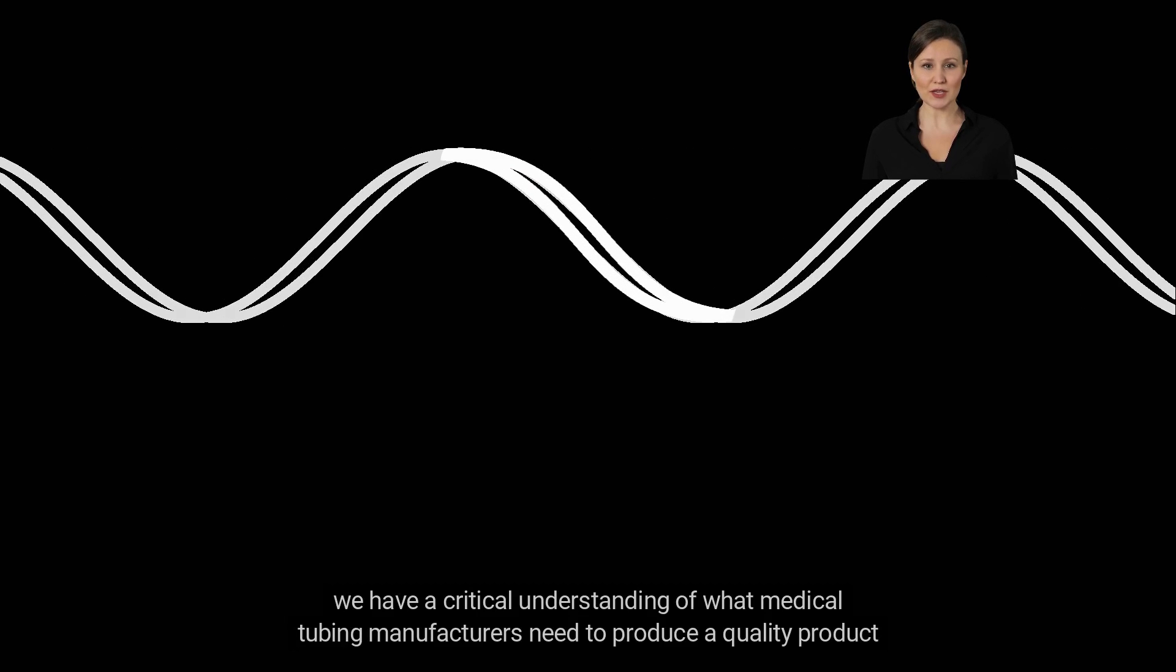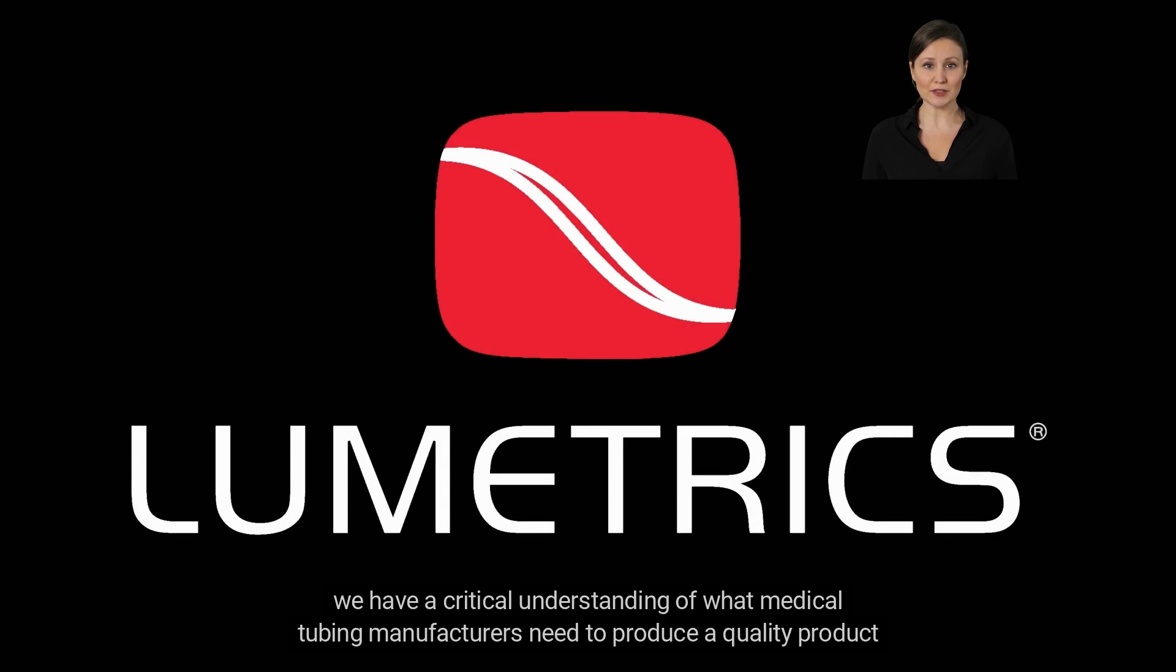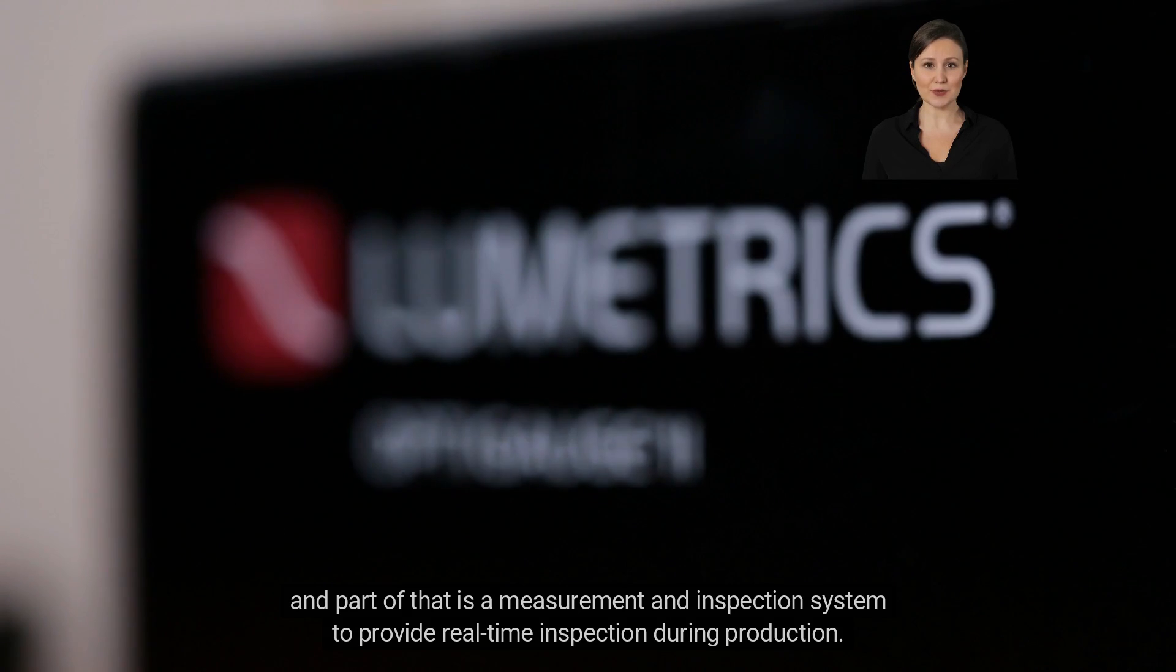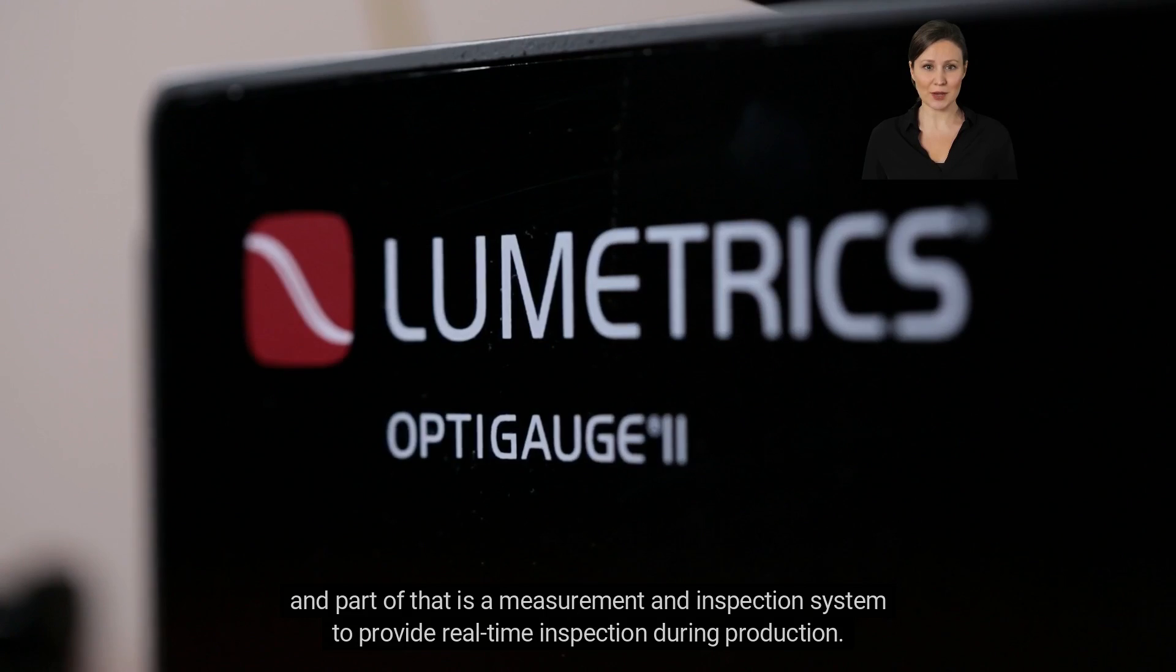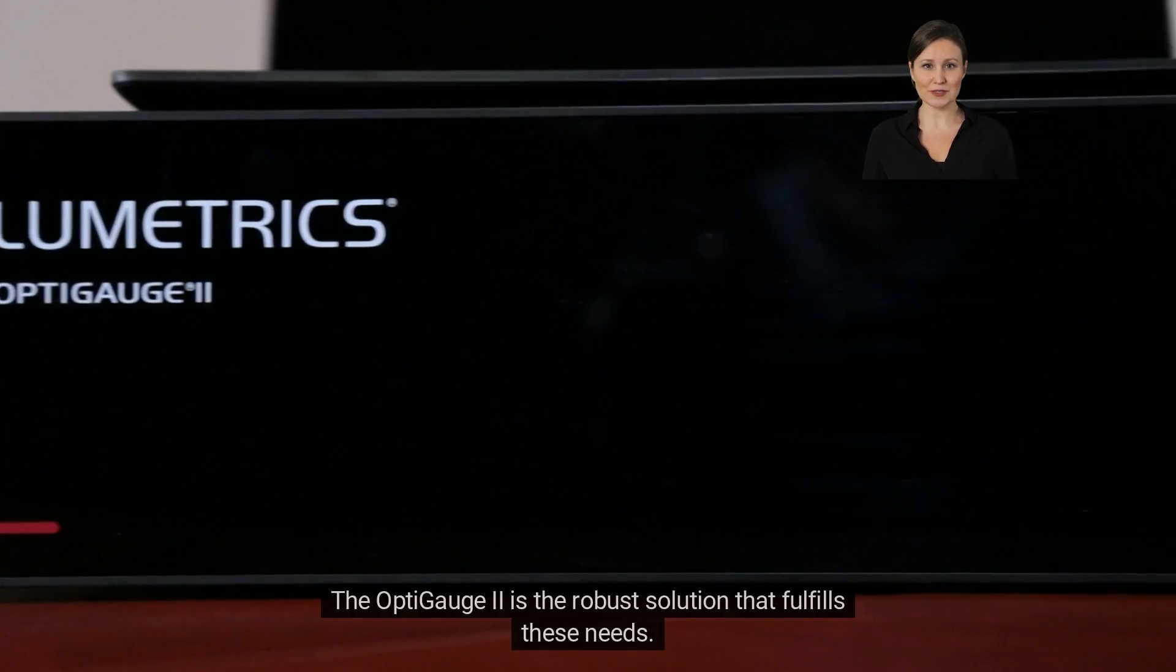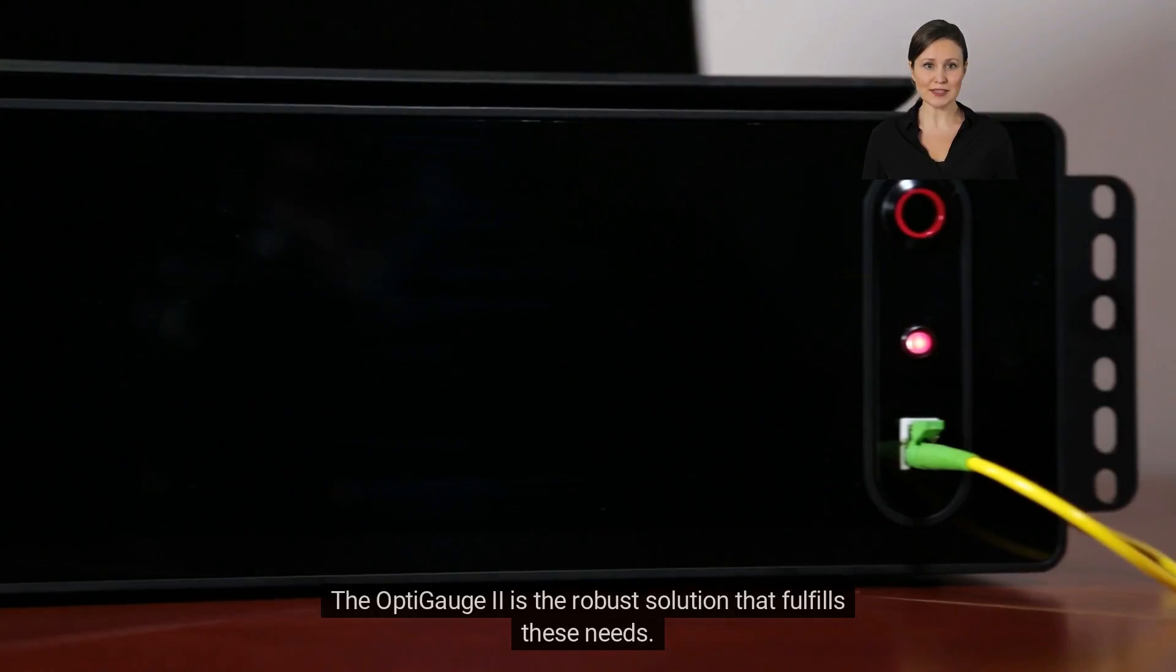At Lumetrix, we have a critical understanding of what medical tubing manufacturers need to produce a quality product, and part of that is a measurement and inspection system to provide real-time inspection during production. The OptiGage 2 is the robust solution that fulfills these needs.